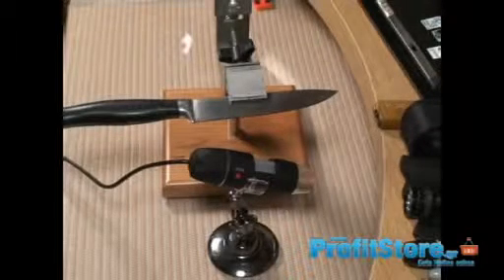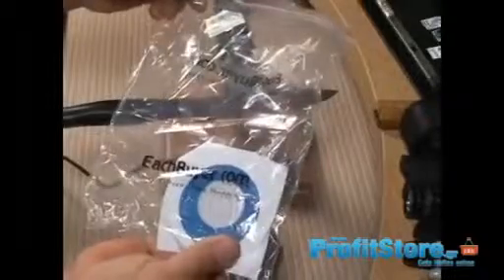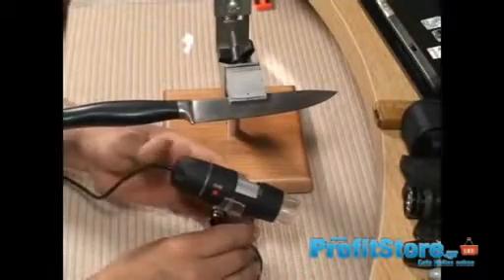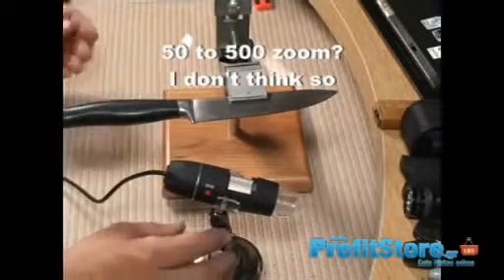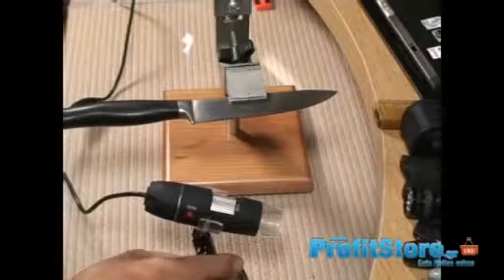And trust me, this is not anything near top of the line. Here's the packaging — a plastic bag and a mini CD, and this was wrapped in plastic. It's supposed to be 50 to 500x, although I take it to about the middle, maybe 200, and that's as close as I can get anything to focus.